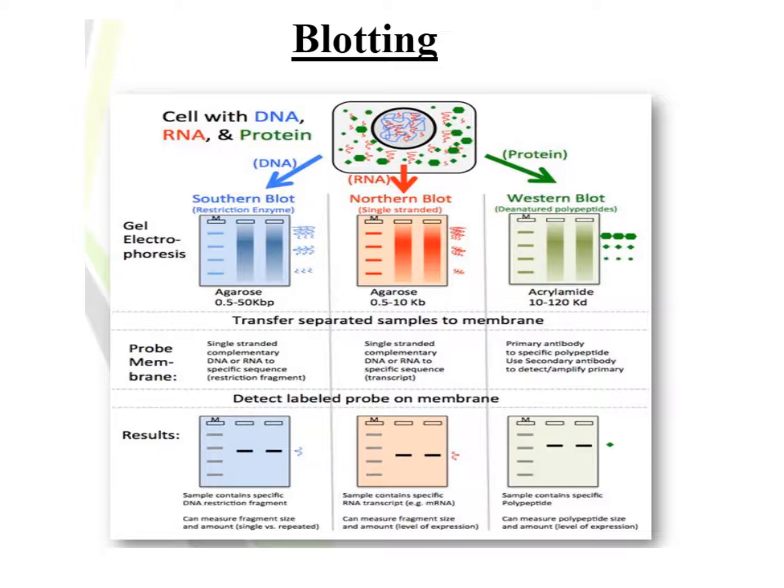So we add the antibody and it sticks to the protein. The secondary sticks to the primary antibody. So we have the goat antibody, then we have the rat antibody, then goat anti-rat secondary antibody, and we do some type of signal generation, and we're able to see. And these are pre-stained standards, and we can develop a standard curve here and predict what molecular weight those are.